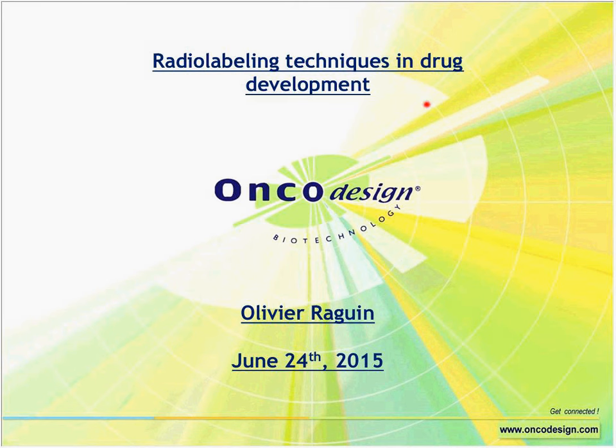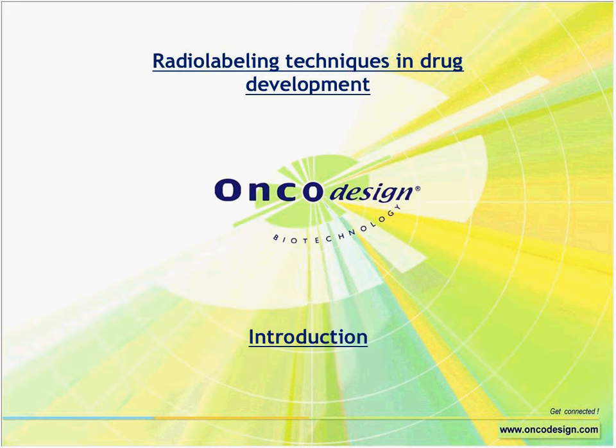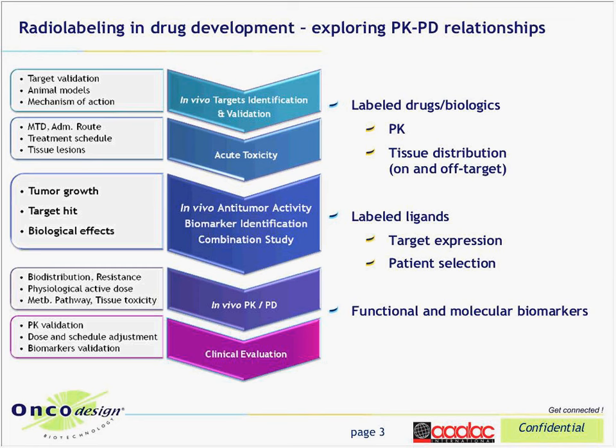So let's start with this presentation dealing with radiolabeling techniques in drug development. During the preclinical phase of the development of a new drug, numerous data have to be gathered to provide the proof of concept and also to help the project go towards clinical phases. We need first to choose the right animal model for the molecule to be tested.